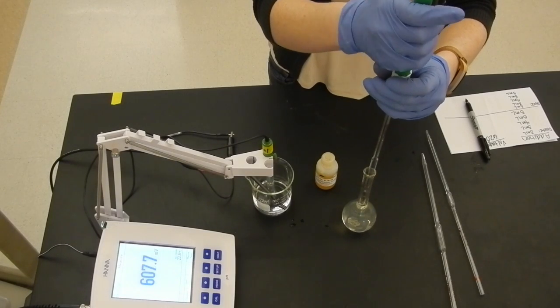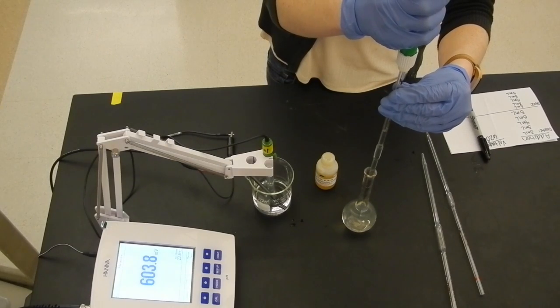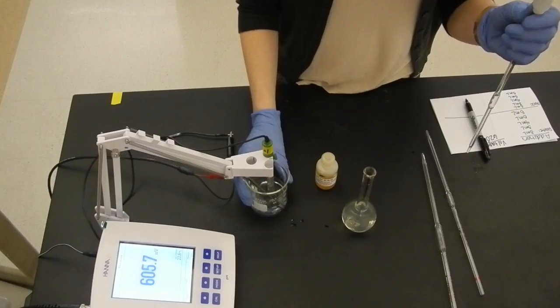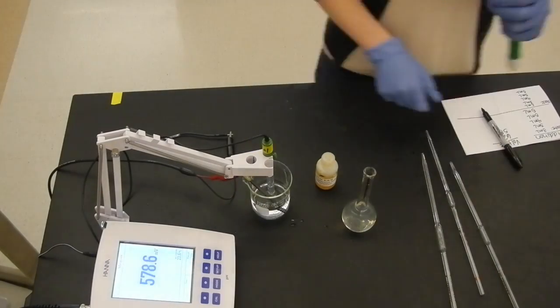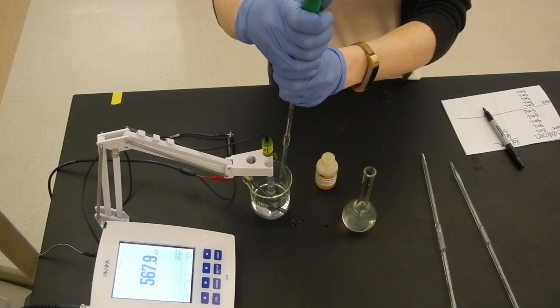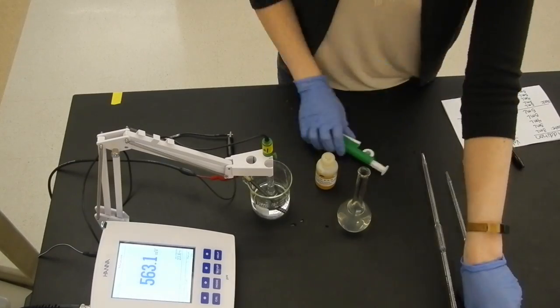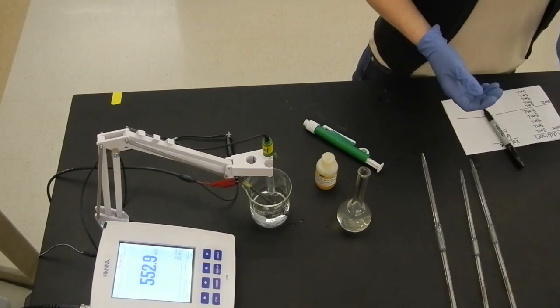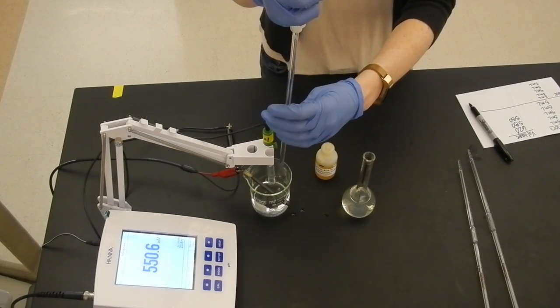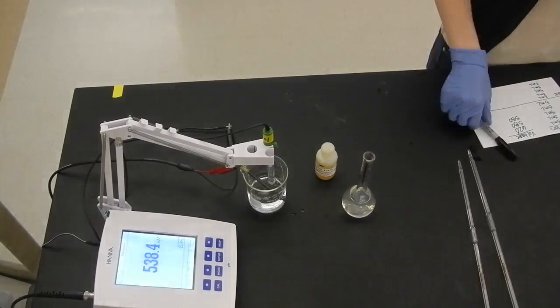This is repeated for several more additions of the dilute iron 2 solution, followed by several additions of the stock iron 2 solution. Remember to mix the reaction beaker and record the millivolt reading with each addition. Once 10 readings have been made, we will be ready to move on to part 2 of the lab.